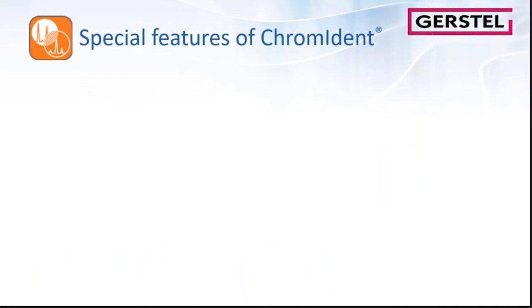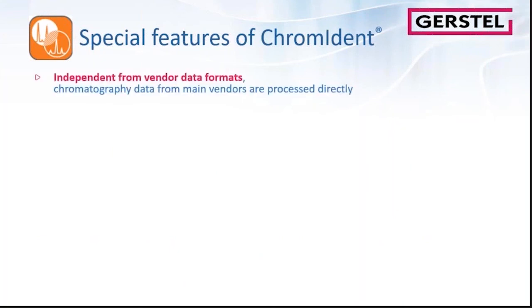So yeah, there's so much more to say about the software ChromIdent. So far I have introduced you to the basic functionalities. There are a few things I wanted to highlight here. First of all, I haven't mentioned the software is able to handle data formats from different vendors. So the main vendor chromatography data can be processed directly here.